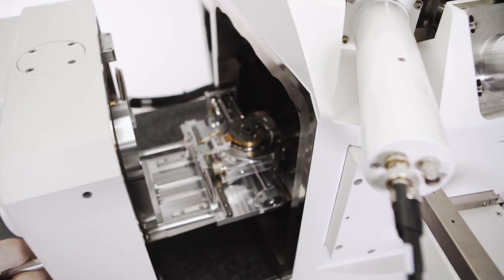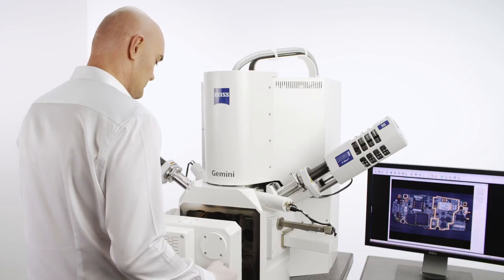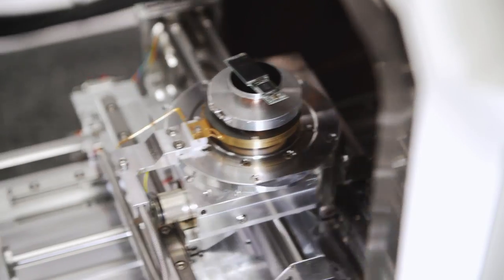I first used an electron microscope 20 years ago as a physics student and I've always been fascinated by its technology. I understand how important it is to make this high-end technology more accessible through an excellent user experience.